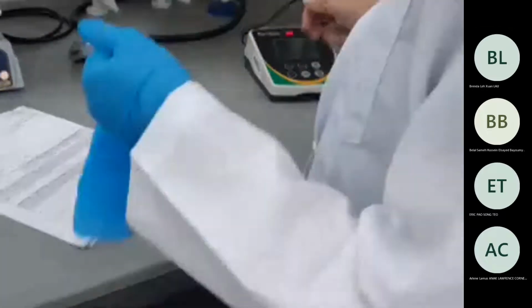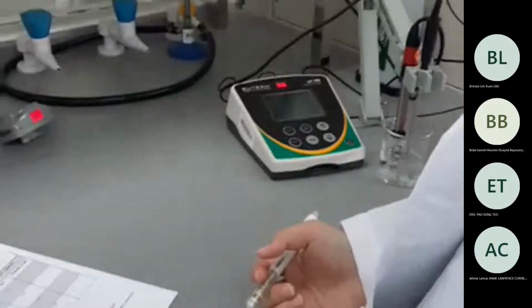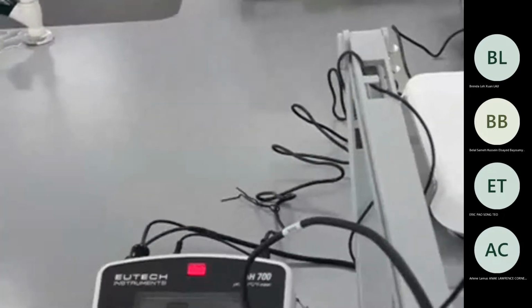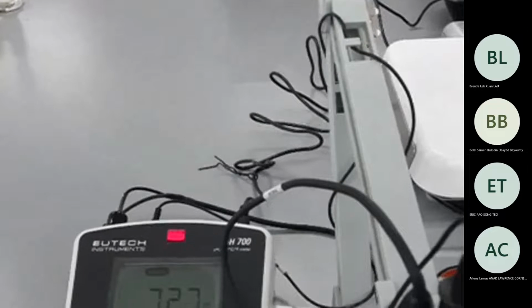So it is increasing for... My guess is it will be around 6.3 for you. Okay, let's see what Lane is having. Okay, 7.3 now for the tap water and still not ready.